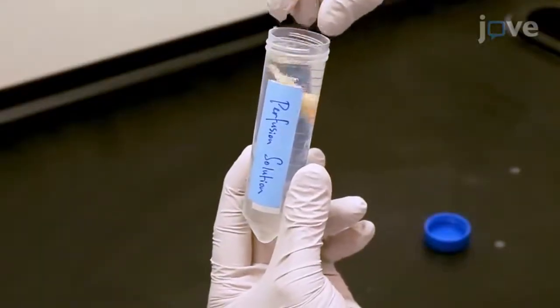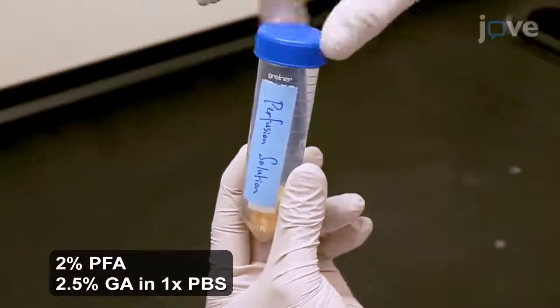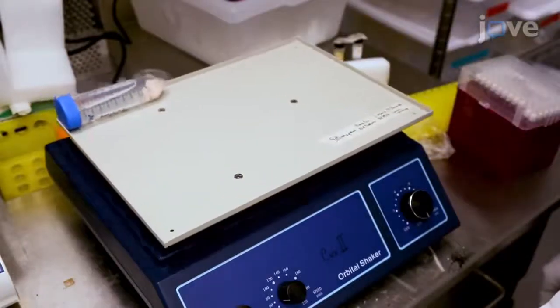To begin, place an extracted brain in perfusion solution in a 50 milliliter conical tube. Store the sample for 2 to 3 days with gentle shaking at 4 degrees Celsius.